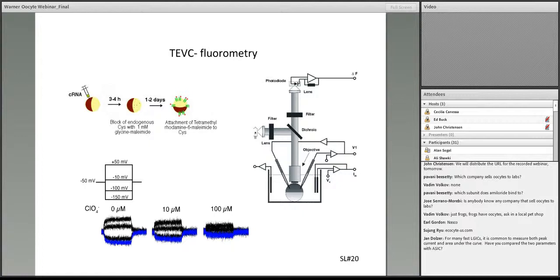The left lower panel shows representative changes in fluorescent intensity evoked by a blocker of the transporter and measured at different voltages. This result indicates that the cysteine in one of the transmembrane domains senses both conformational changes induced by the blocker and by changes in membrane voltage.